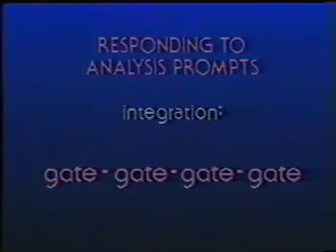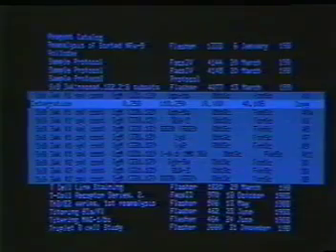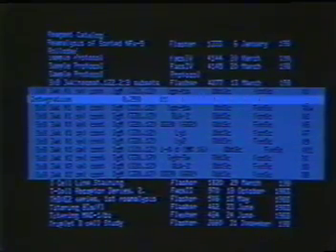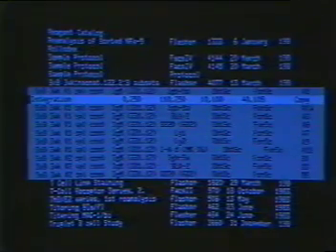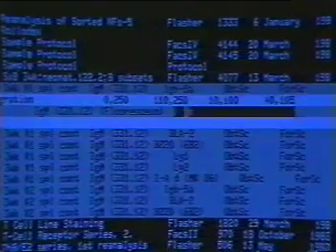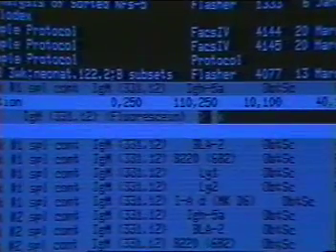We'll now take a closer look at how to insert integration requests onto an analysis card. To insert requests, the cursor must be at the analysis line level. With the flat commands, position the cursor on a white line below the sample you wish to analyze. Press Insert to begin the analysis prompt sequence. Fluorescein is the first prompt for this experiment. The X which appears in the black box is a default response. To enter an open gate, simply type 0 and press Return.